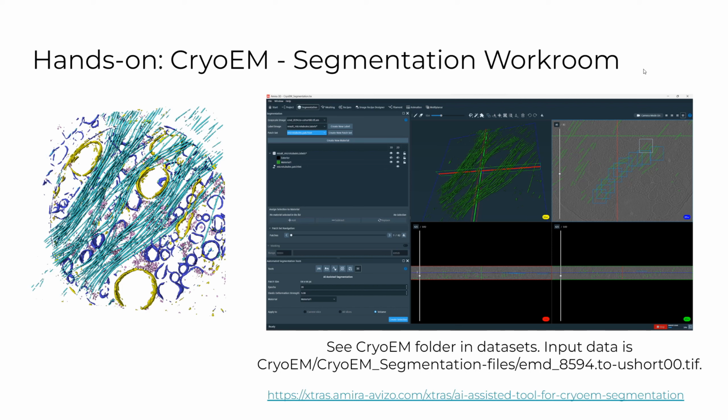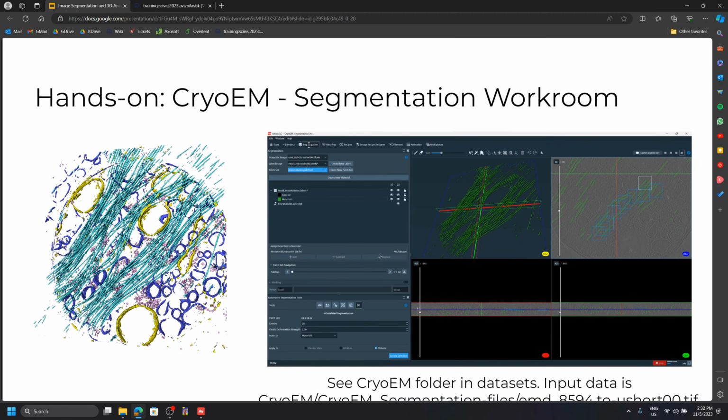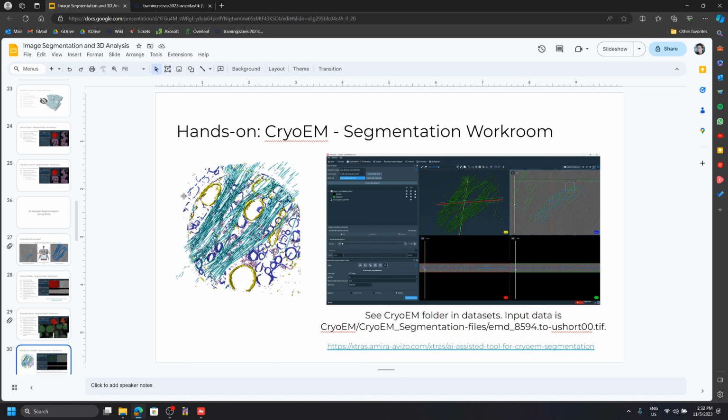All right, so who among you has the deep learning environment installed? Okay, that's fine. So we're just gonna go through this example, right? So when you get access to a machine with a GPU and the deep learning environment, you can try this example.